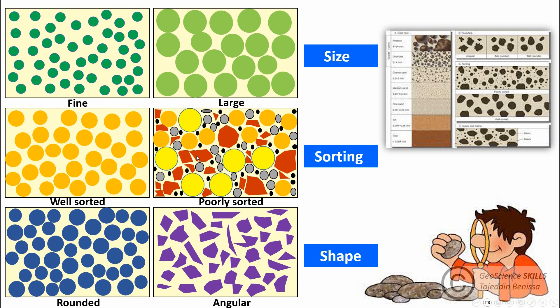In terms of sorting, rock texture can be described as well sorted or poorly sorted. Well sorted indicates homogeneity and similarity in grain size, while poorly sorted indicates grains with different sizes and shapes, as we can see here.